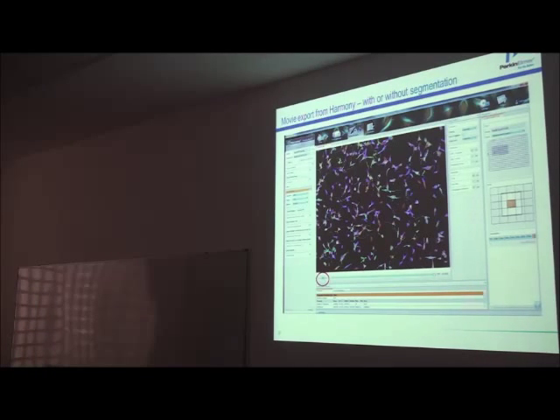The other system can go like 15 frames and still a lot slower than microscopes, which you can operate in streaming, like 90 to 100 frames per second. But this is typically 3 frames per second. And that's actually one other difference between standard microscopy or confocal microscopy and this. Because in this case, it's going to be slower in order to extract more information. There are applications that you better do on a standard microscope, confocal microscope, like the calcium assay, for instance. It's better to run it on the other one.